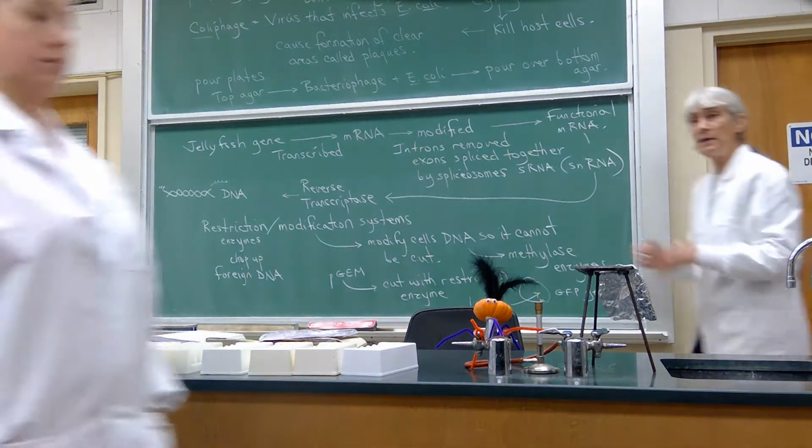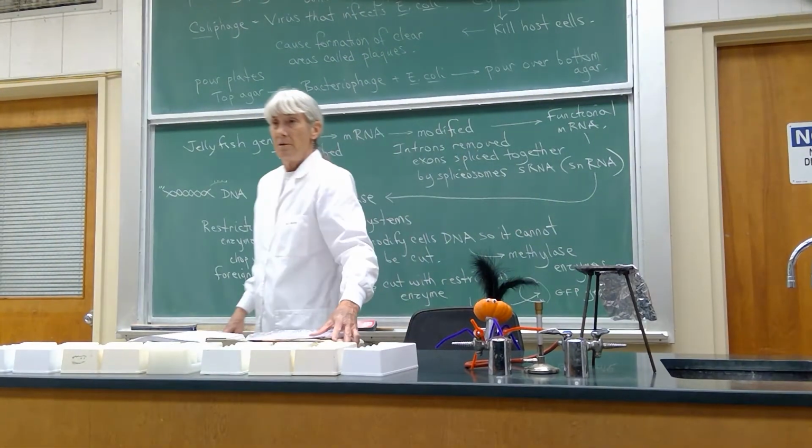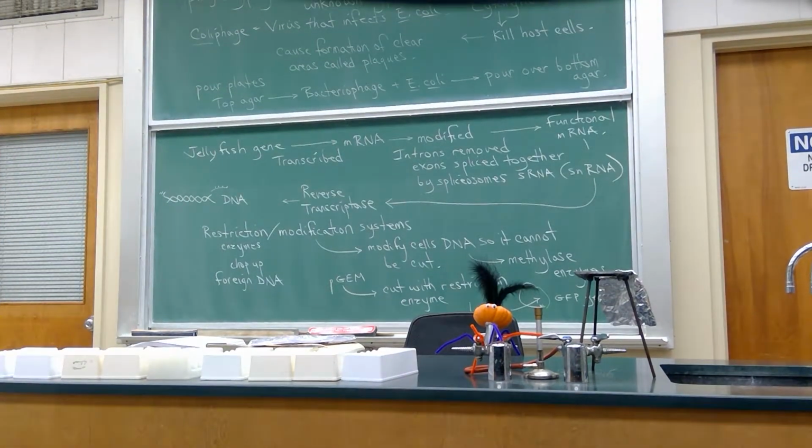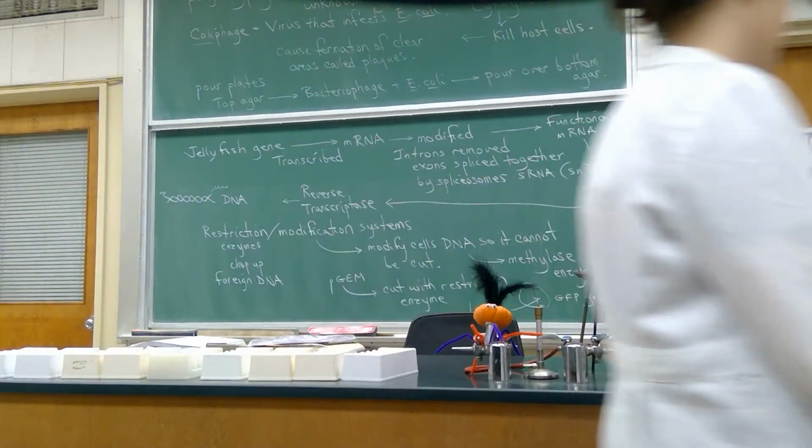Put them on the burners. Grab the burners from the racks. Grab them next to the stand. Sunny, I wasn't going to move the stand, I was going to pause.